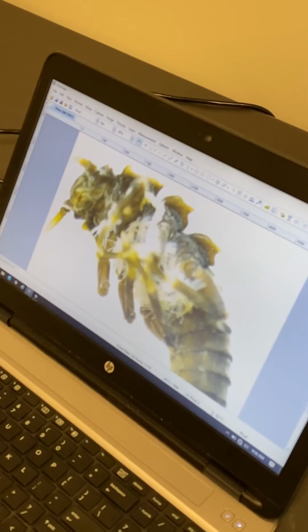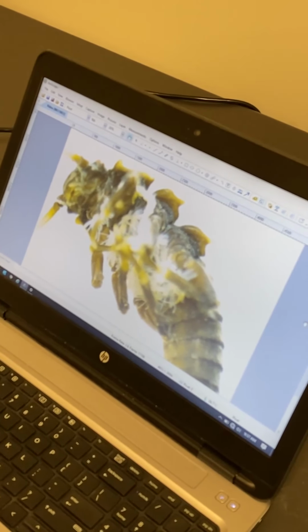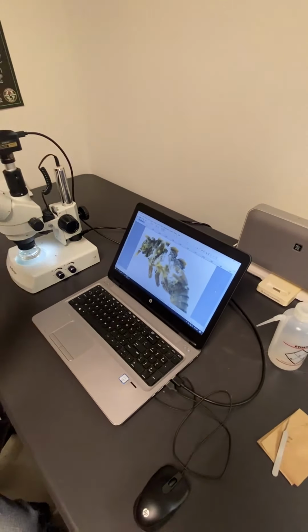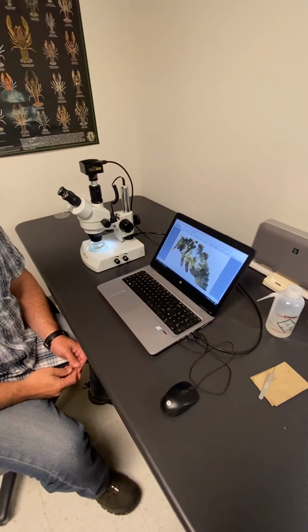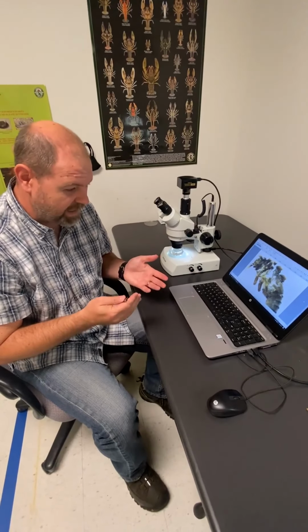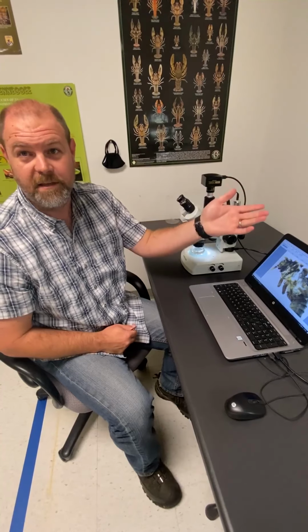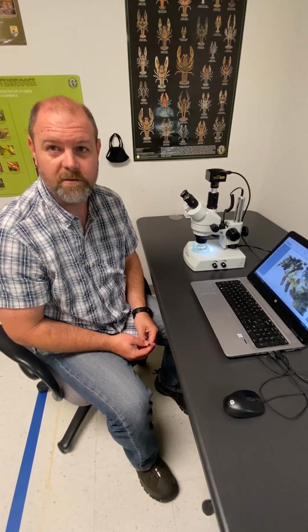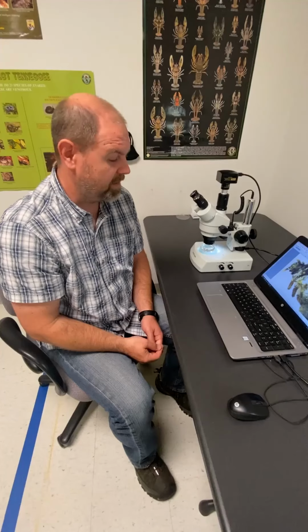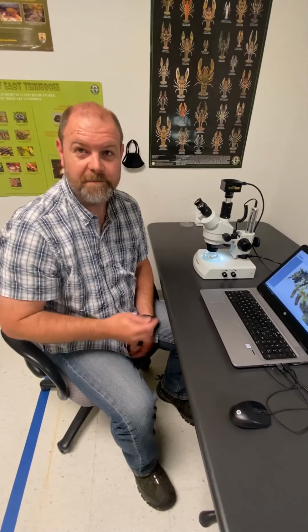So ergonomically, how is it being able to look at the insects on a screen rather than looking through the microscope? I prefer using just the scope instead of the screen. I try to use the camera as more of a teaching tool. If I have a question about a bug, I'm not seeing something right, or if it's a new bug nobody's ever seen, I can actually take a picture of it with the camera and send it to other experts across the state who might be able to help me out. So that's a great tool for us to have too. We don't have to ship the actual specimen itself to them, so we can just take a snapshot. But I prefer just using the microscope.